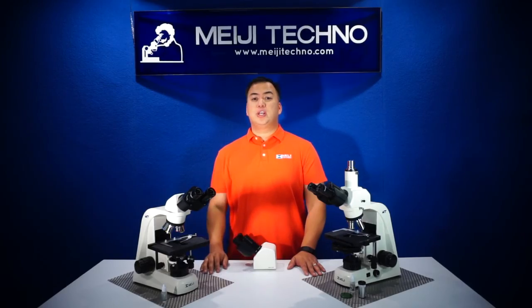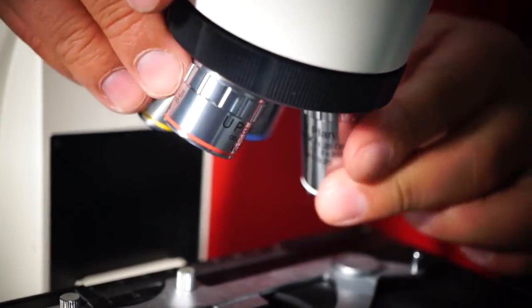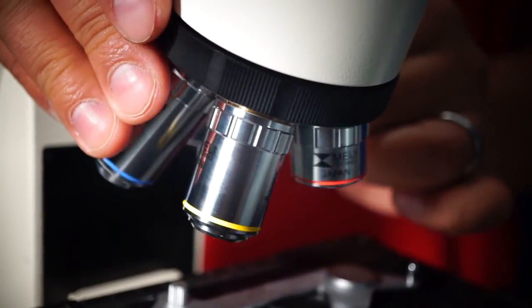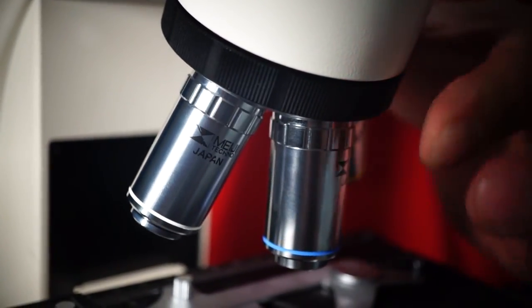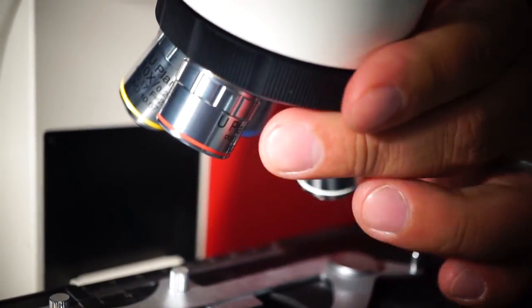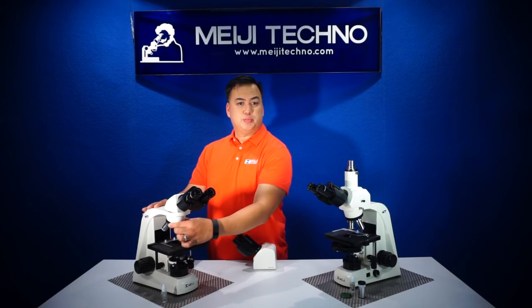Normally included are the 4X, the 10X, the 40X, and the 100X infinity-corrected optics on the brightfield model, which can be easily switched by rotating the smooth operating ball-bearing quintuple nosepiece.